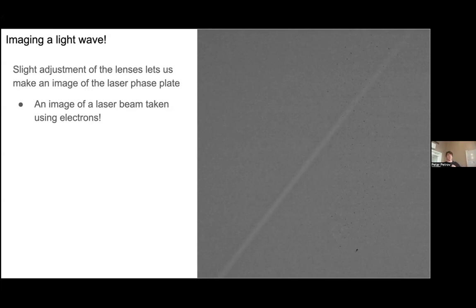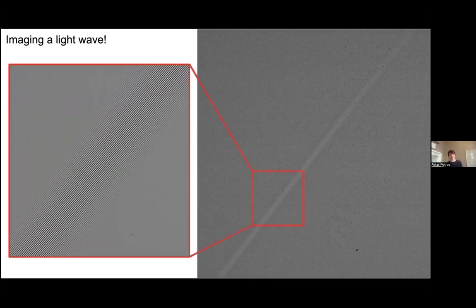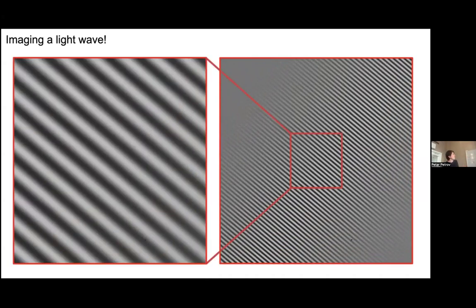You might be able to see an image of dust scattering off a laser, in a cloud or something. But in this case, the laser is actually just going through vacuum, and you can still see it because the electrons are what's forming the image. And we can zoom in on it, and you can start to see the standing wave structure here of the laser. So you can see the areas of high and low intensity are oscillating, and you can zoom in further and further still, and you can really see the laser standing wave really nicely.